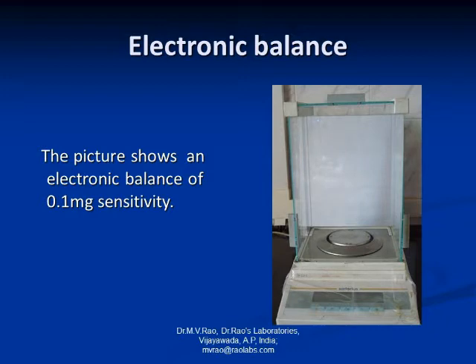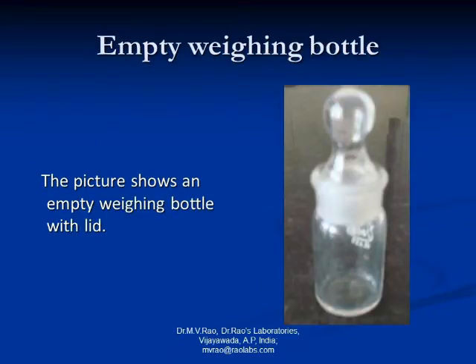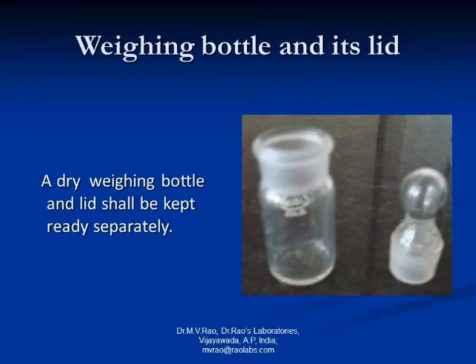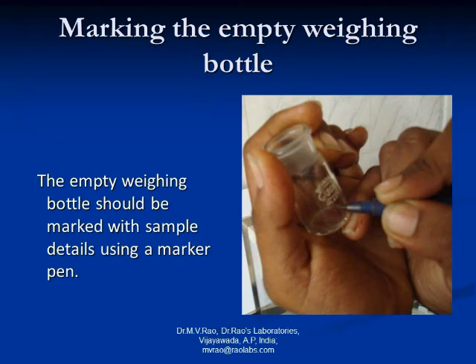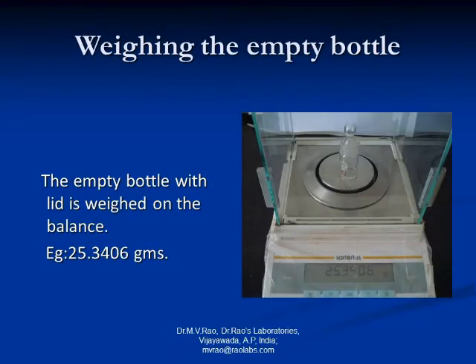This is a digital balance of 0.1 milligram sensitivity which is used for testing moisture. This picture shows an empty weighing bottle with lid, which is ideal for moisture test. The lid prevents reabsorption of moisture from the atmosphere after drying the sample. The weighing bottle and lid should be perfectly dry and kept ready separately. The empty weighing bottle should be marked with sample details using a marker pen. The empty bottle with lid is weighed on the balance — in this case, the weight is 25.3406 grams.